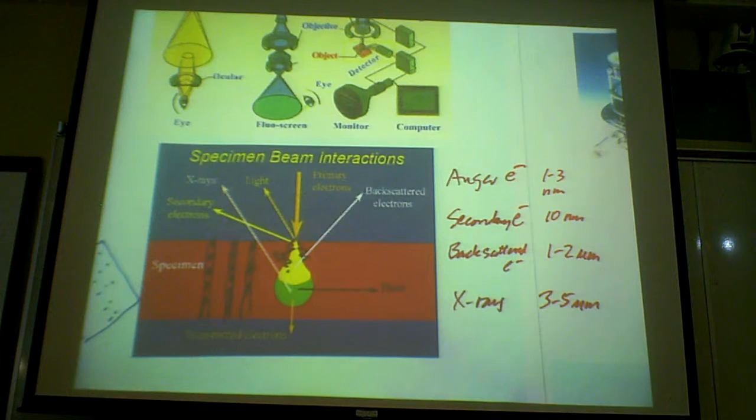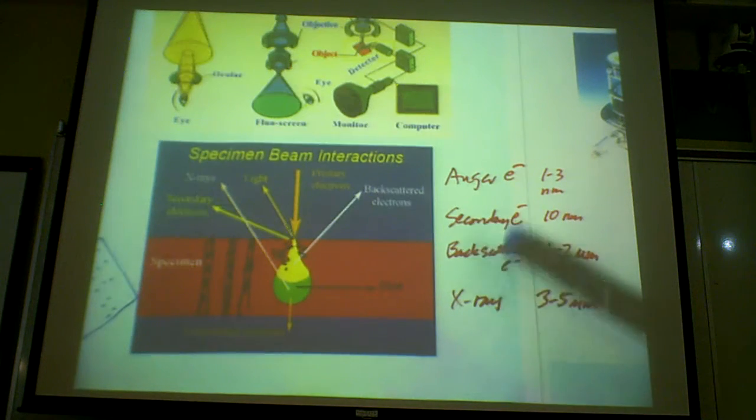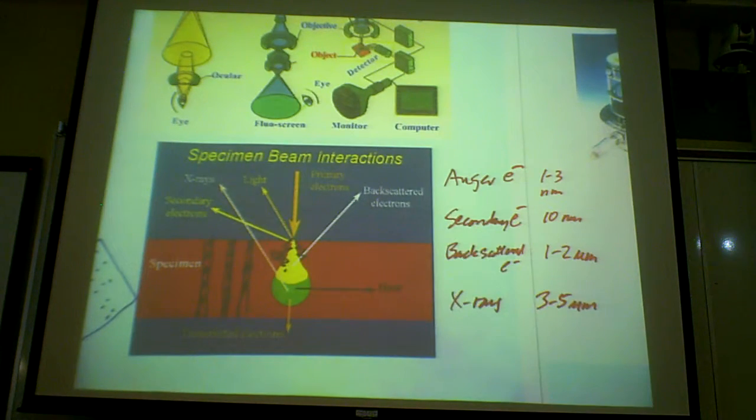So that's the secondary electron. Whereas in the case of backscattered electrons, you can actually detect either directly the electron current, because there are a lot more of them, or you can detect in the same way using scintillator technology.